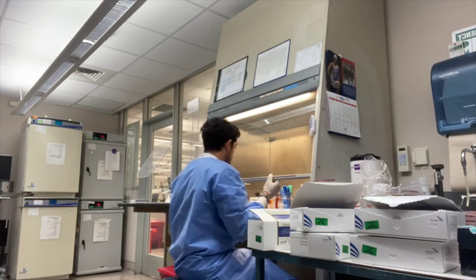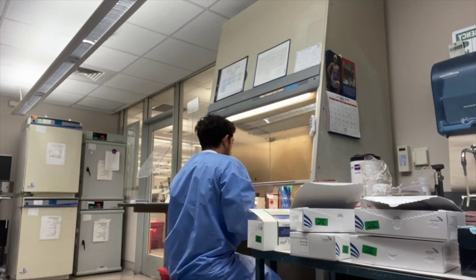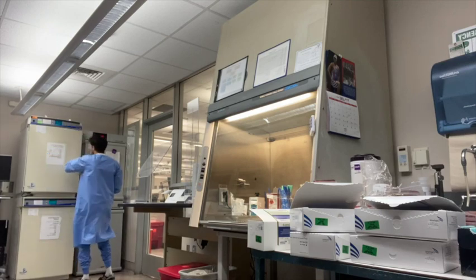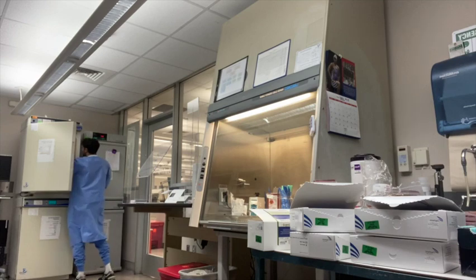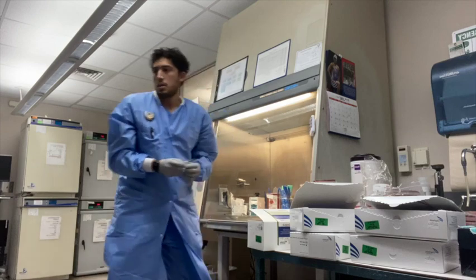Other tests that are performed in microbiology can include COVID flu test, MRSA test, and various other cultures. After I plate the specimen, I can go ahead and place it into the incubator, which I'm doing here. That encourages growth, which the CLS will see the following day.